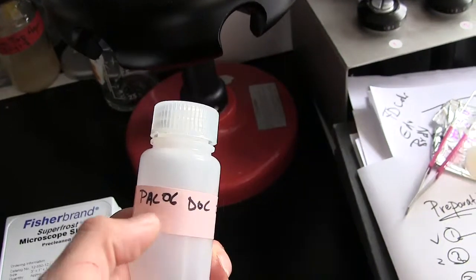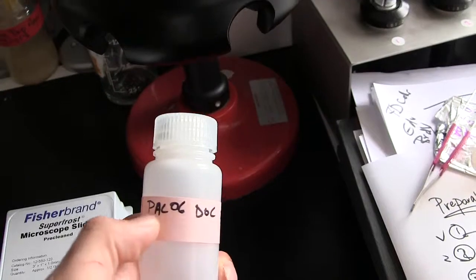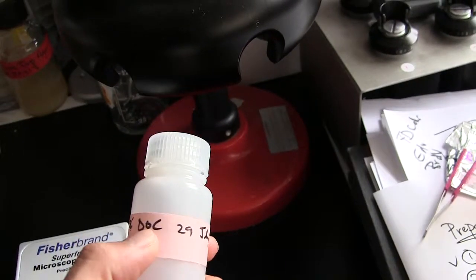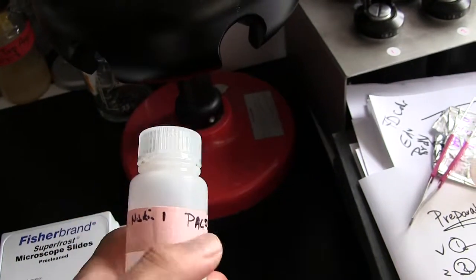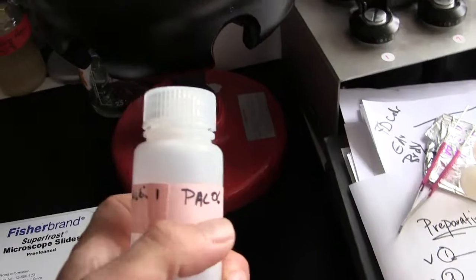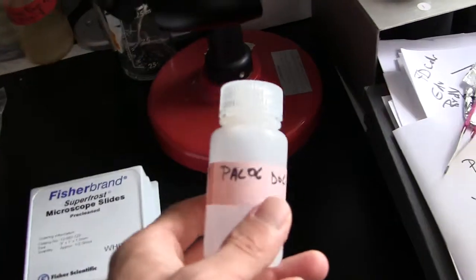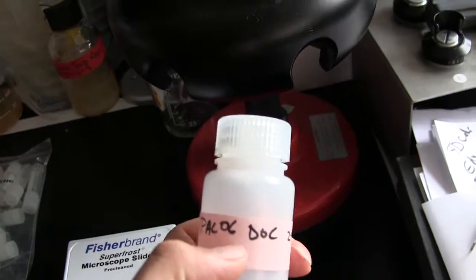It works very well. Alright, a consistent naming theme throughout our samples: it goes site, nature of the sample, date, initials, and then the Niskin bottle that it came from. Usually you collect 2 Niskin bottles per site, so usually it's Niskin 1, Niskin 2. Later on, as you go down through the samples you collect, there are some samples we pool across Niskins, so that information is no longer necessary, but usually there's other information.